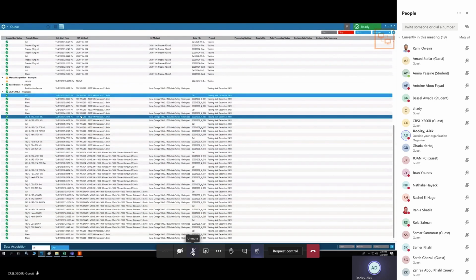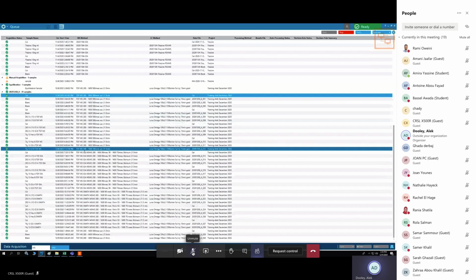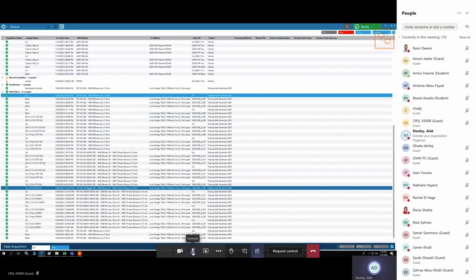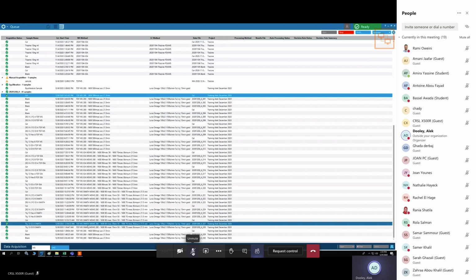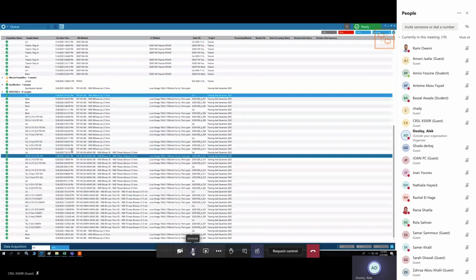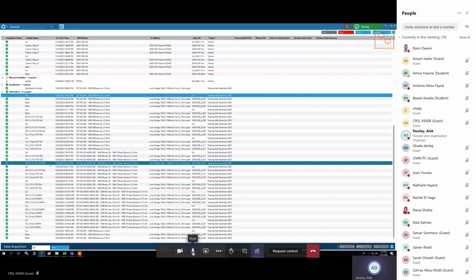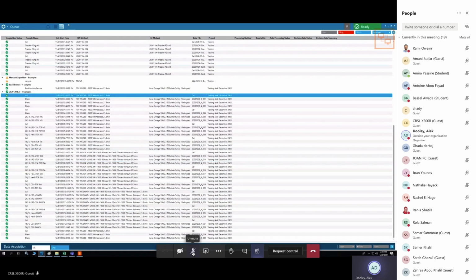Don't forget, we made 3 methods yesterday. We made just the TOF-MS method, and then we made an IDA method, and then we made a SWATH method. So we have 3 data sets from the identical samples. And then we'll decide which mode to progress in.